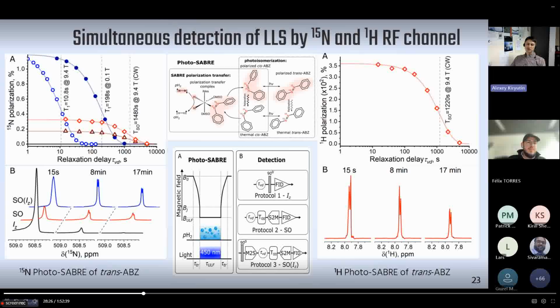Well, I think since it's in a liquid state and you don't have any kind of phase transition, meaning crystallization, it should be fine. We actually didn't vary the temperature so much. But I think if it's in the same liquid phase, I don't think that temperature will change a lot.